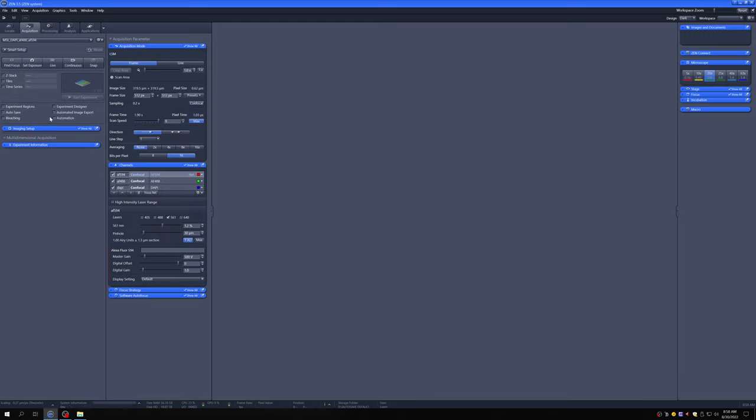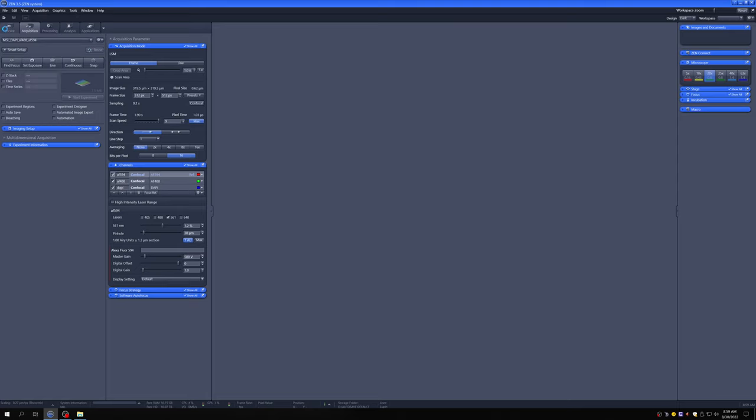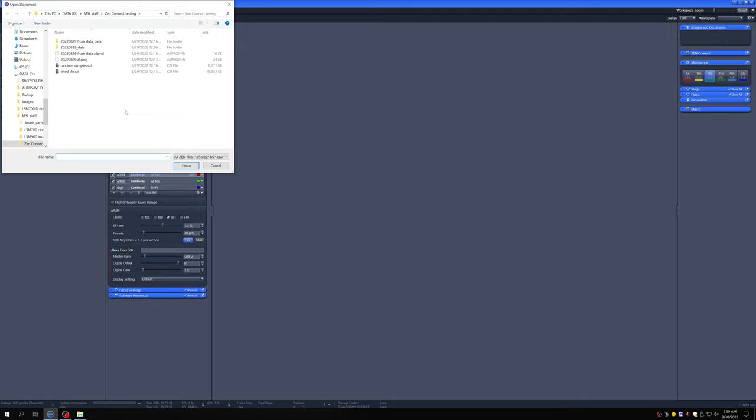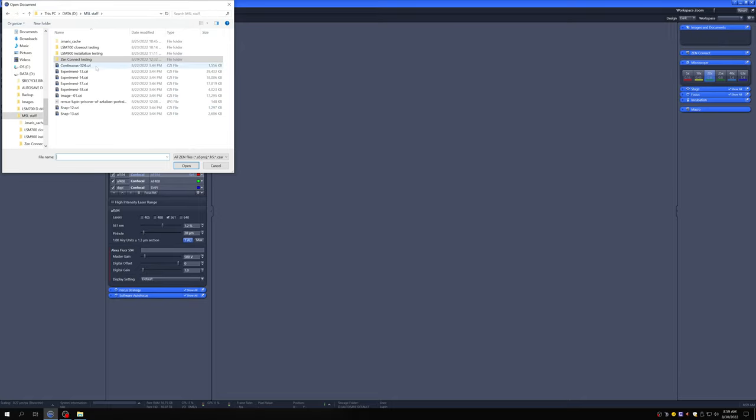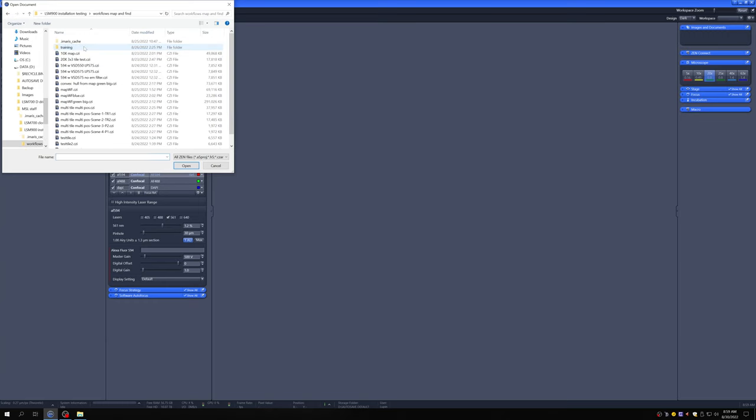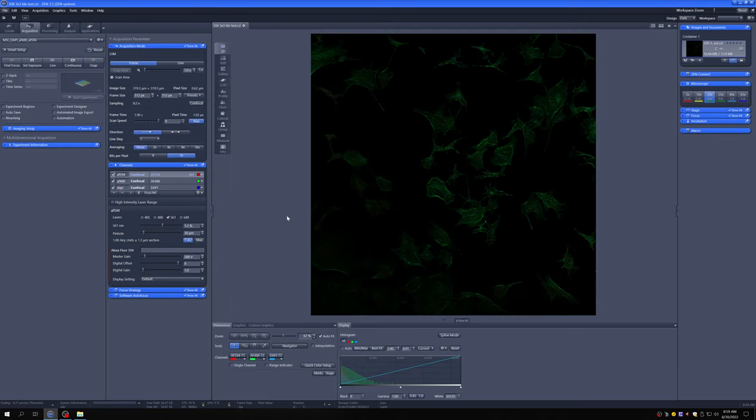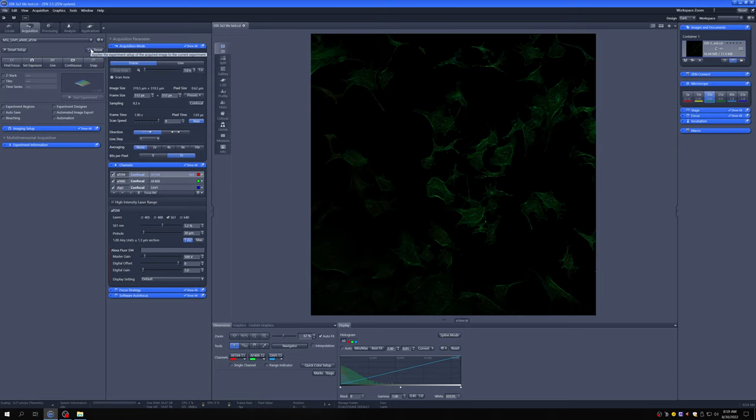If instead I wanted to load settings from an image, I could do that by opening an image. So as an example, I could open this image. And then I could reuse the settings from this and the way to reuse the settings is by clicking here.